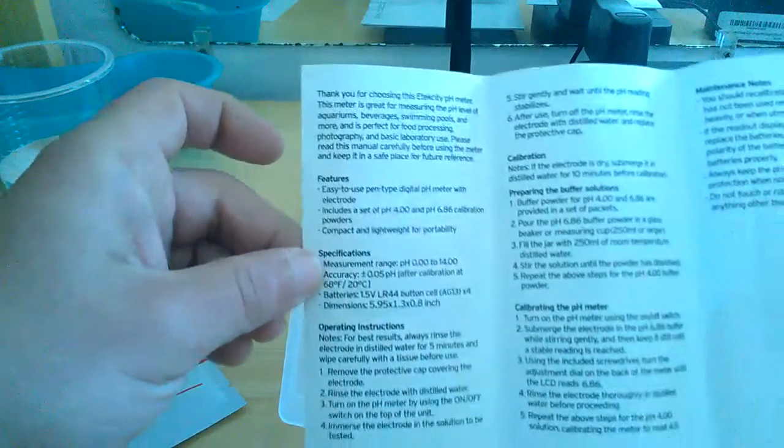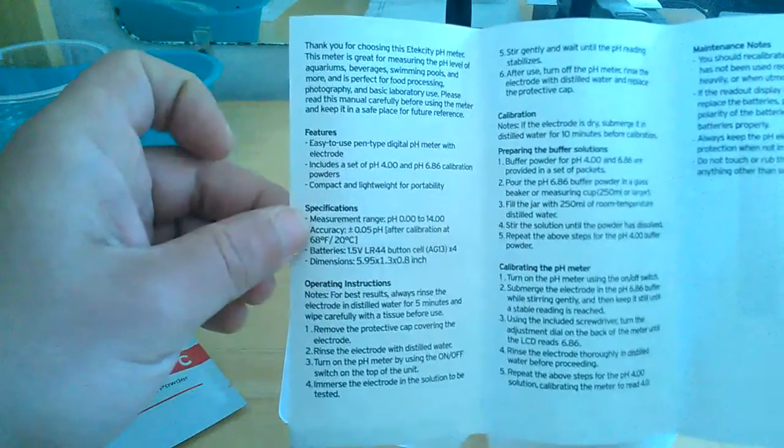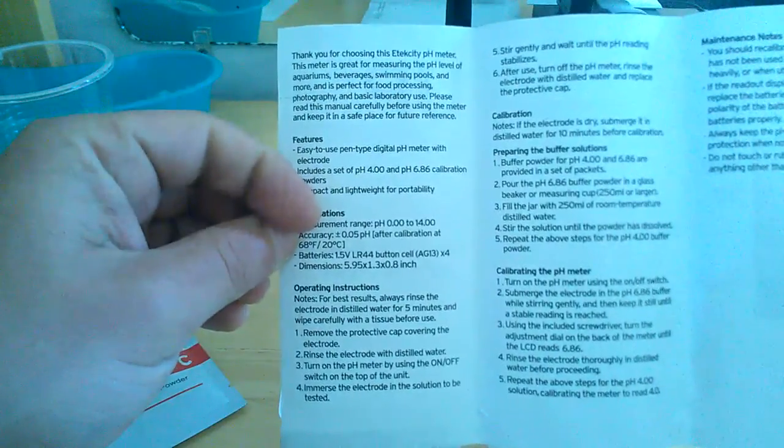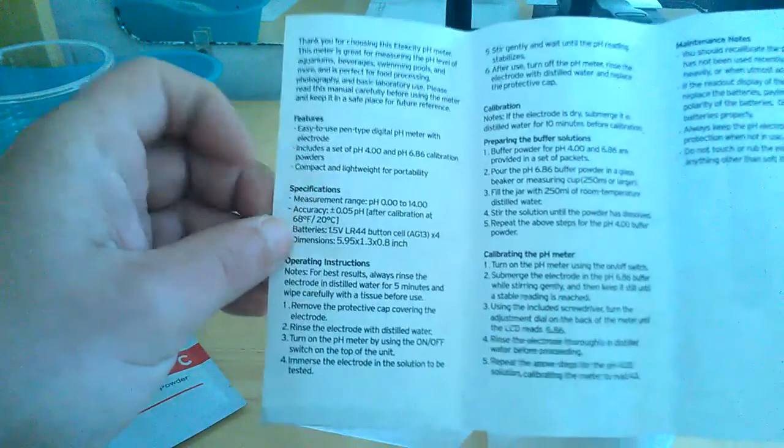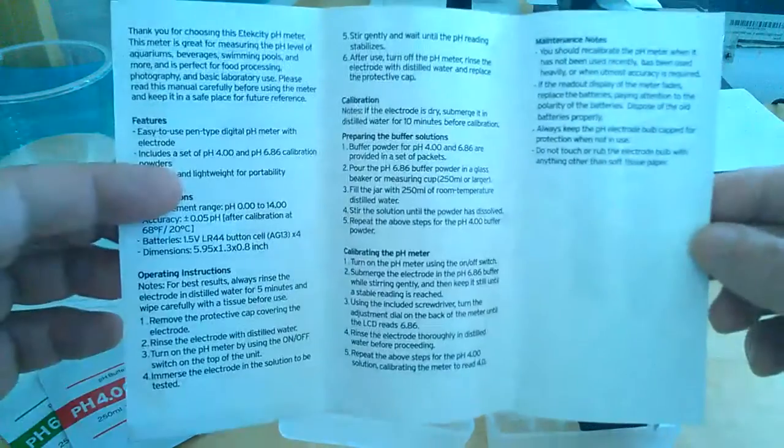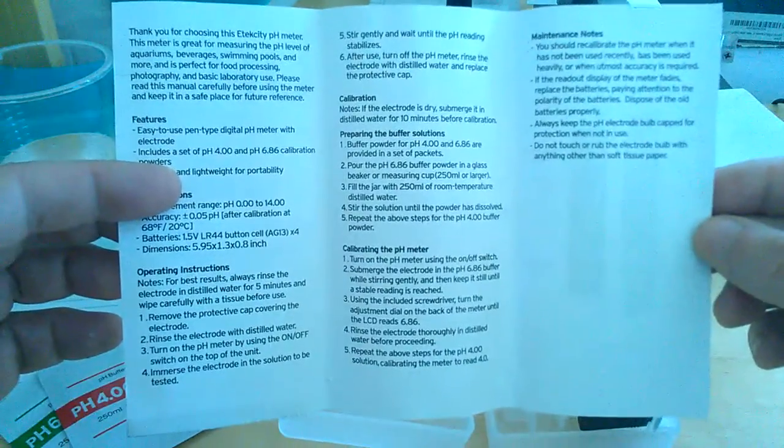Very simple. Very nice. Easy to use. Thank you for choosing the E-Tech City pH meter. Very nice to see right off the hop. Very respectable of the company. Features, specifications, operating instructions. It's all very straightforward guys.